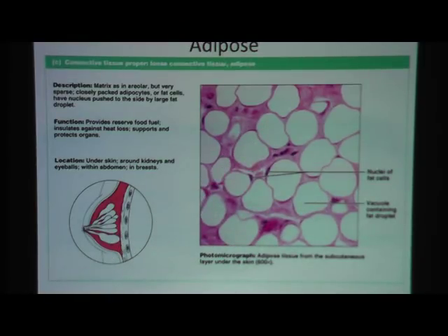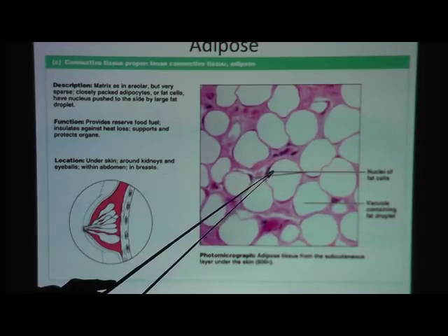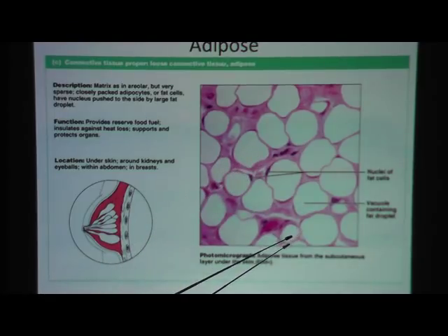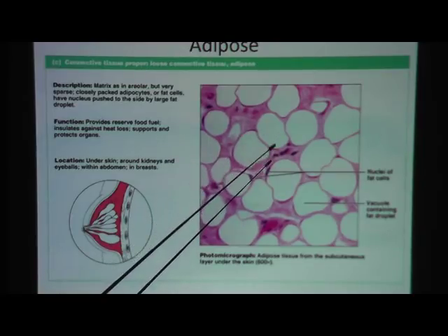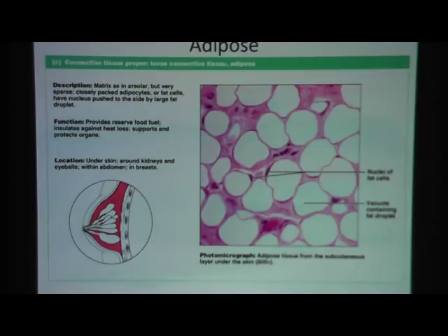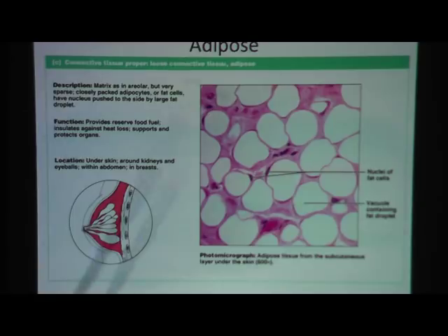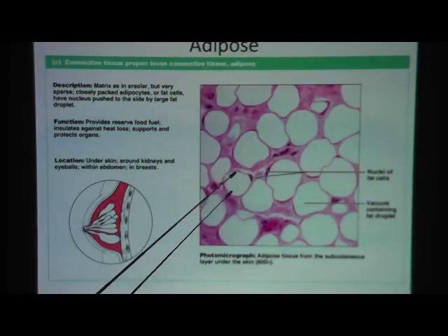Most of the time when you talk about a cell, we want to see a nucleus — and here it is. But notice the other cells don't have visible nuclei. Keep in mind, this looks like a circle on a two-dimensional surface, but in reality it's actually a sphere — a ball — and it's full of fat, because that's the purpose of a fat cell: to store fat. Because it's so full of fat, the nucleus is pushed to the side. So sometimes the nucleus is above the cut plane, and sometimes it's behind it. At any given moment when we make a cut, it's just by luck that we cut through the nucleus — but that doesn't mean the cell has no nucleus.